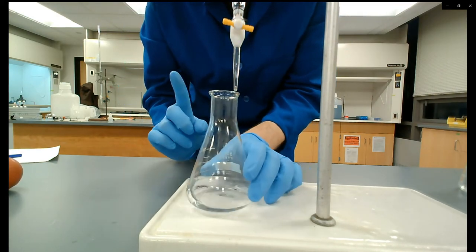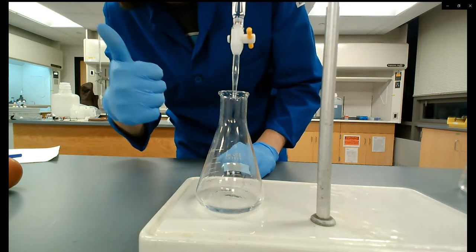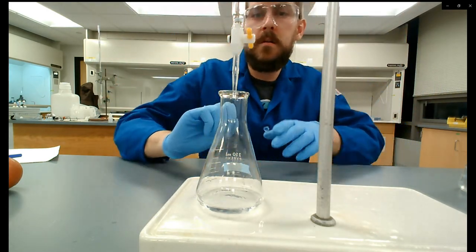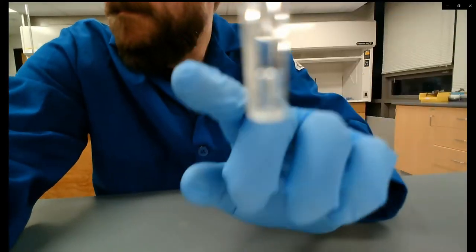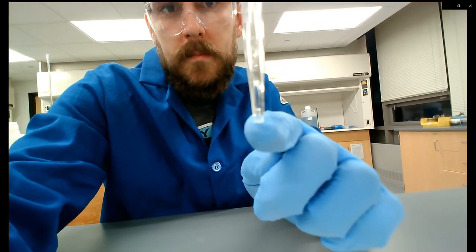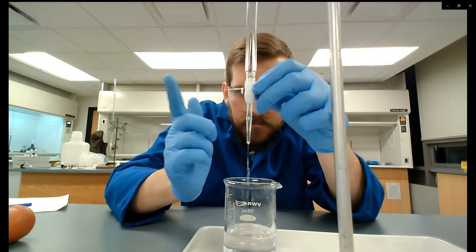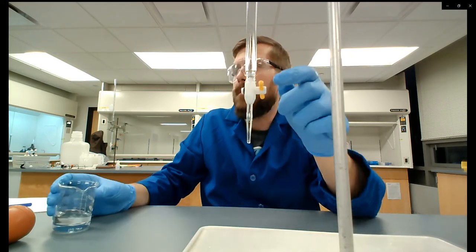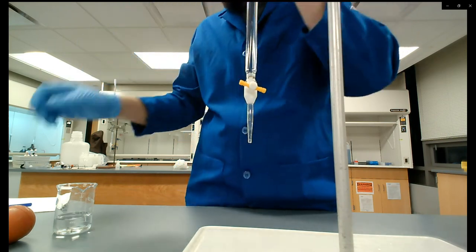You want your burette tip to be a little bit inside your Erlenmeyer flask so that as you're swirling you don't accidentally dispense sodium hydroxide outside the flask. Before I start, I notice there's a small air bubble in the tip of my burette. I need to get that out — otherwise I'll be dispensing air when I think I'm dispensing sodium hydroxide, yielding inaccurate results. I'll drain the tip, give it a couple taps, make sure there are no air bubbles, tap the tip off, and reread my initial burette reading since it has now changed.